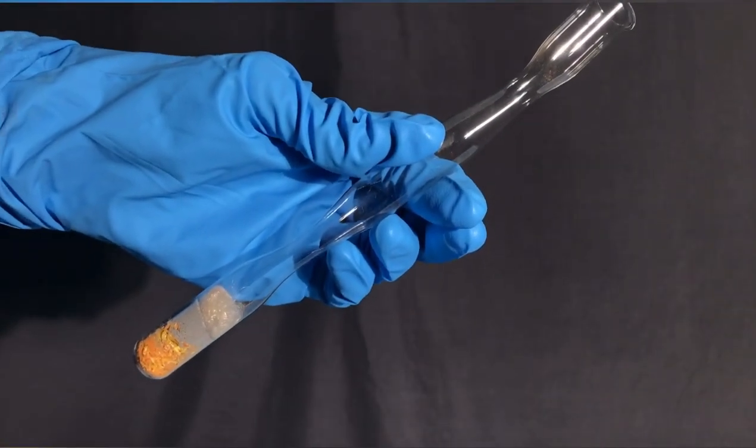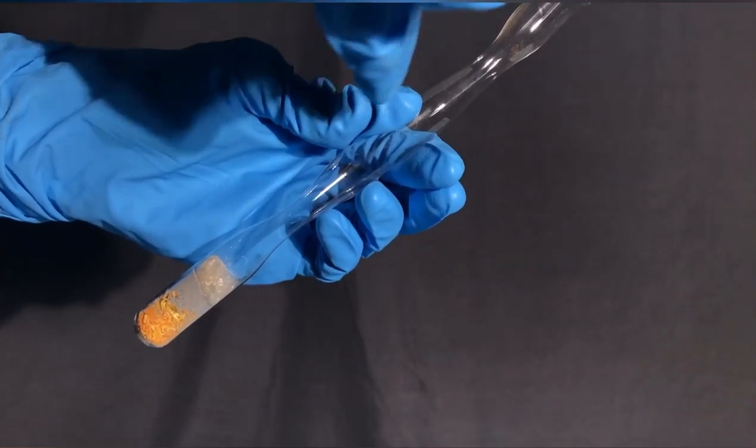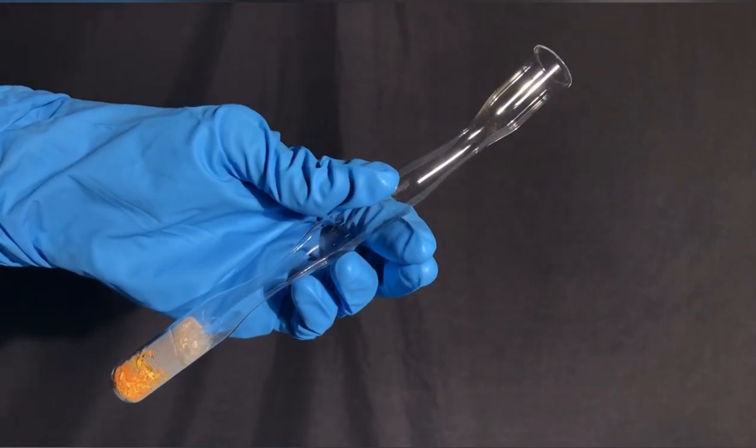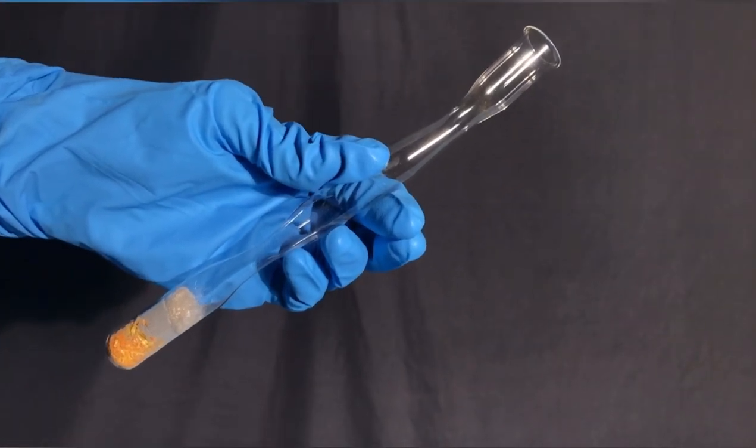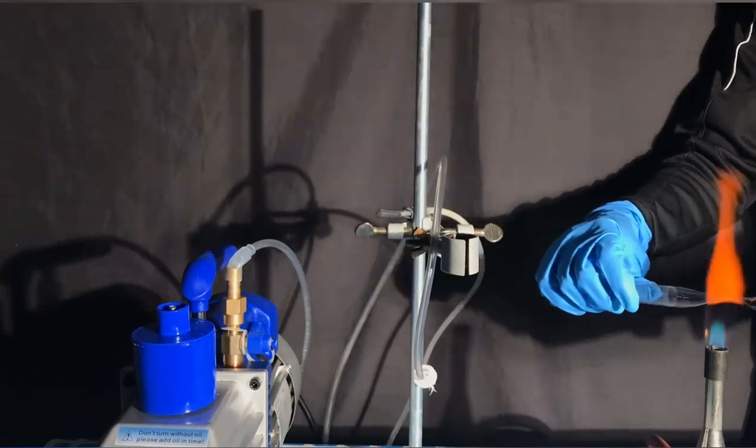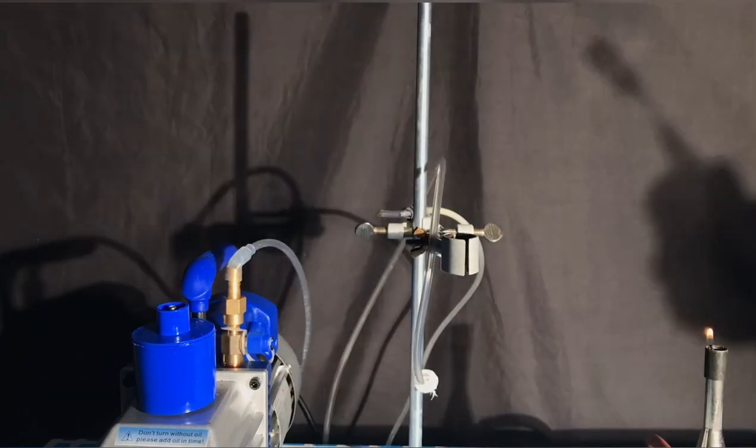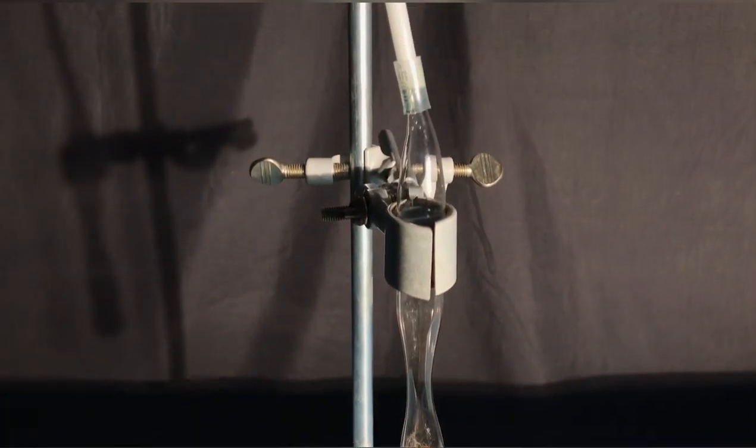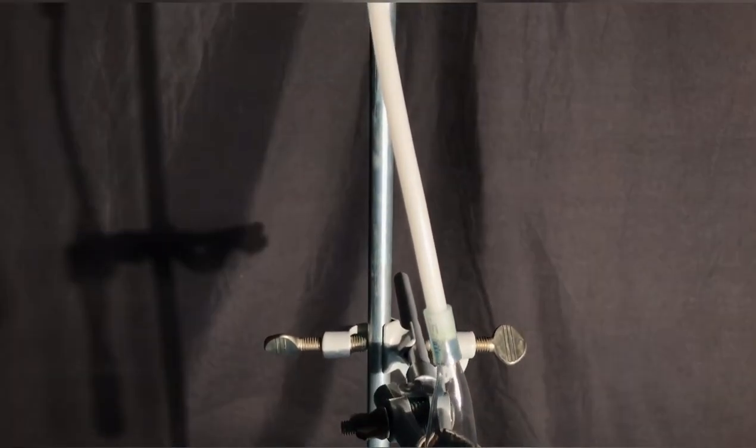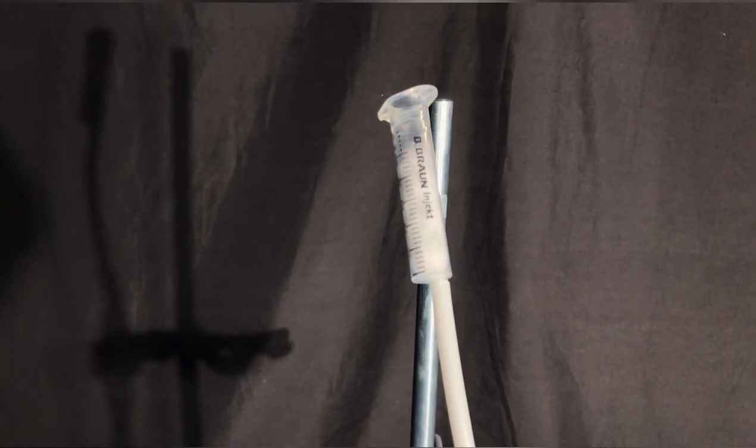In the end we were left with this 3 part ampoule. At the bottom we have the reagents, in the middle some part where to condense the arsenic, and at the top a part to connect the vacuum pump. The neck was stretched out a little longer to make sealing under vacuum easier, but it sadly broke and we fucked up. I wanted to purge the ampoule with carbon dioxide a few times and evacuate it afterwards only to seal it off.